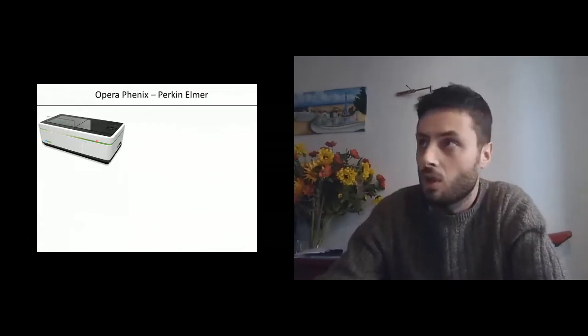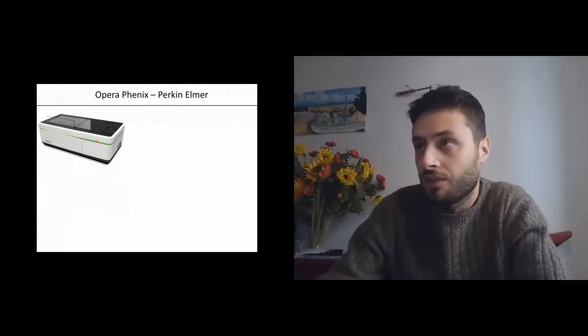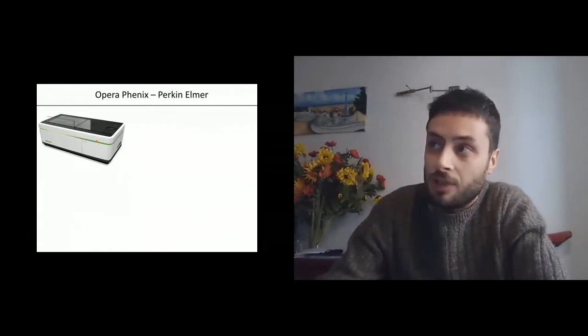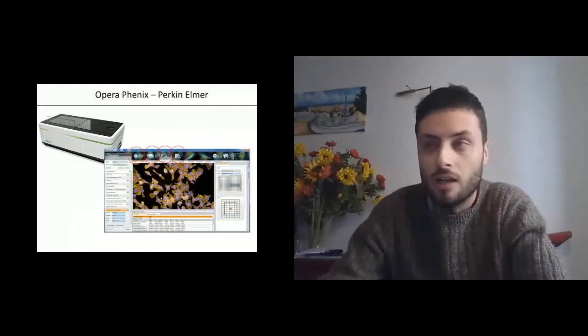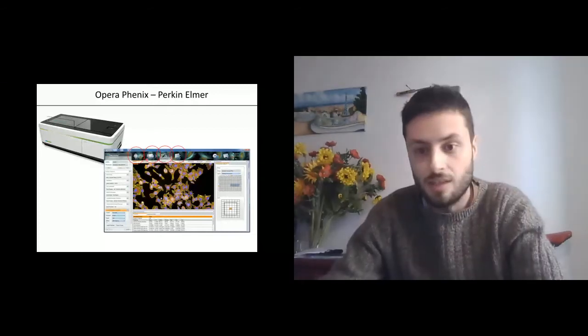which represent the four building blocks that I talked about earlier. In the beginning, you have the experimental setup, in which one can define different channels and different conditions of the sample. Then the run experiment, which is the actual acquisition, the image analysis part, and then the evaluation part. And these two are the parts that require more data analysis and image analysis.